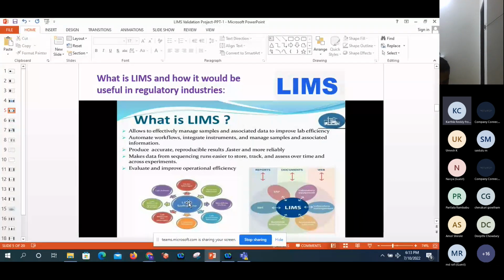People are currently managing without paper, mostly as per ALCOA: attributable, legible, and so on, ALCOA plus. So the data is generated with metadata. This data can be archived and restored in the particular servers, hardware servers.